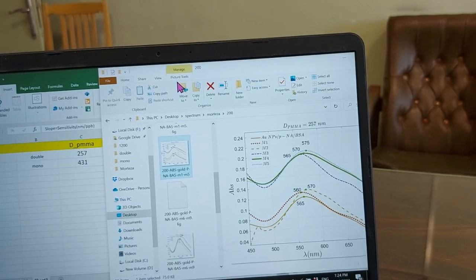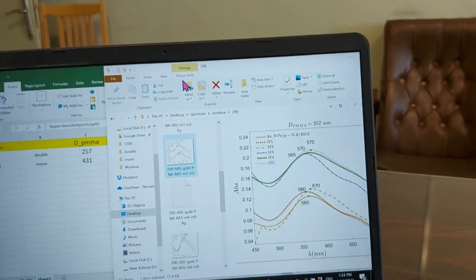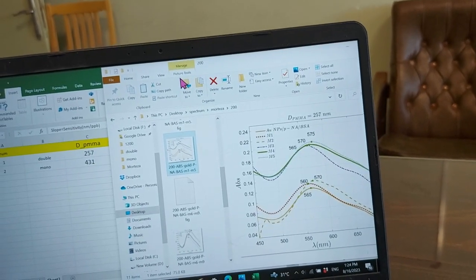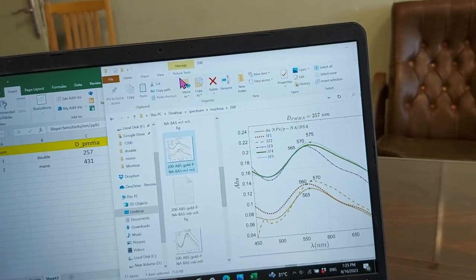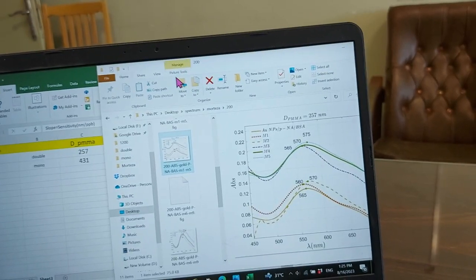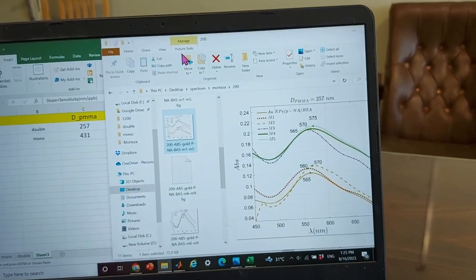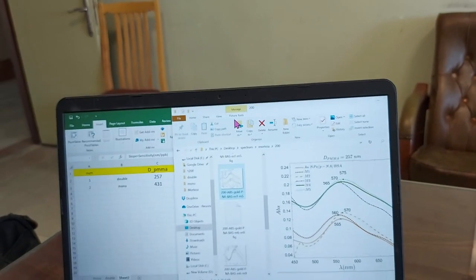Another suggestion for future works for both of you is changing the thickness of the gold that we have deposited, using less or more than before. We should try to find the optimal thickness. My guess is better results for a smaller size. Now you deposit around 50 nanometers, for all your samples. Doctor, we used 20 nanometers, but the result was not good. Yes, do you remember that? The result was not good.